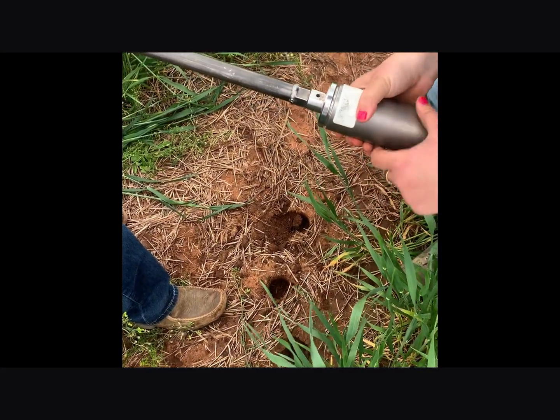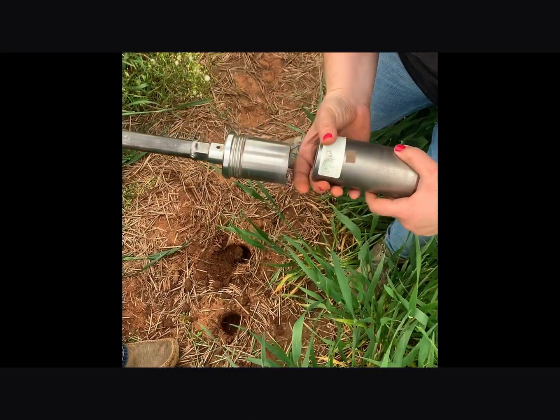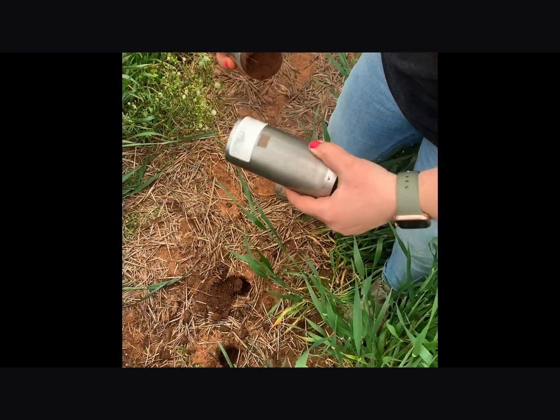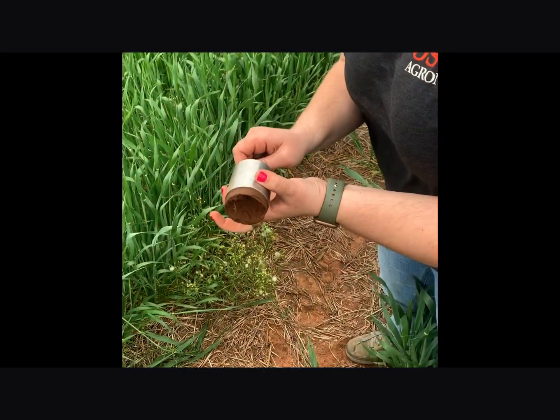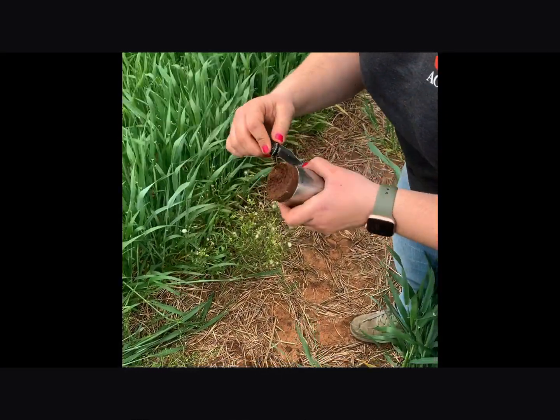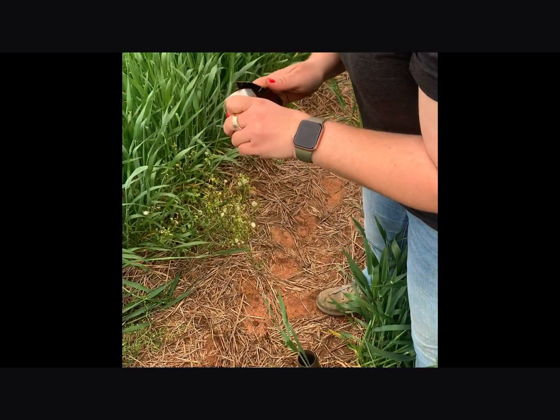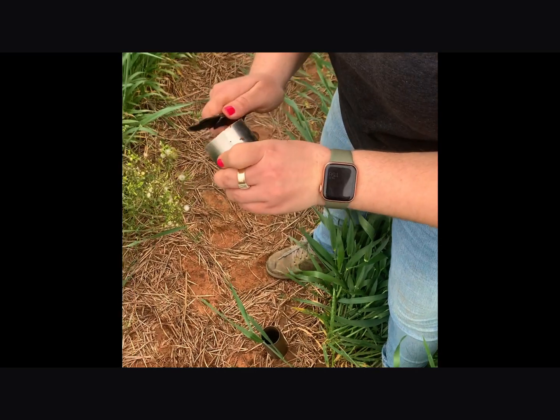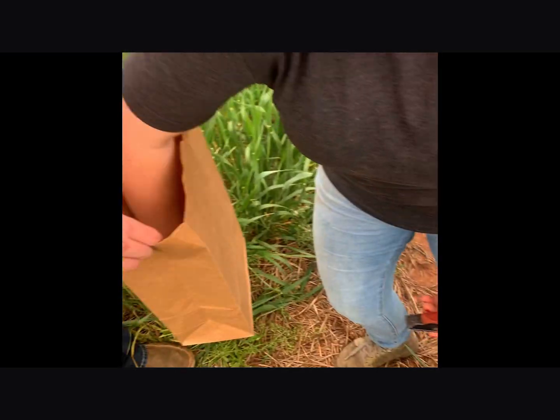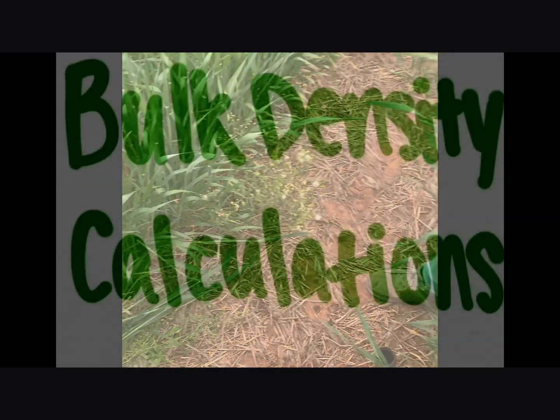After removing the sleeve from the cup, the excess soil is removed from the top and bottom so that it is perfectly level with the sleeve. Once the soil core is collected and all of the excess is eliminated, take it back to the lab and carefully remove all of the soil from the sleeve so you don't miss any of it. You will then dry it at 105 degrees Celsius for 24 hours.